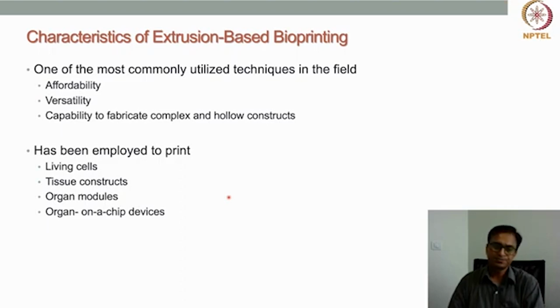Different organ models have also been fabricated with this extrusion based bioprinting technique. So that is also very much possible, and those models have been used for different applications.